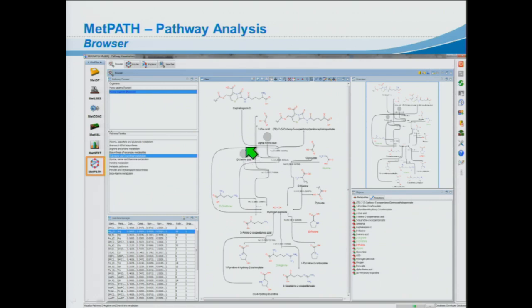So now let's come to the pathway analysis. We can take over the data from the statistical analysis. When we click here on this button, it links the metabolites from the mass spec project to, in this case, we have used HumanCyc, and you can also select the data set here. We support also KEGG. We have in the background a BioWarehouse database where you can load different data sets into this database. And as you see, we also take over the p-values here to this user interface.